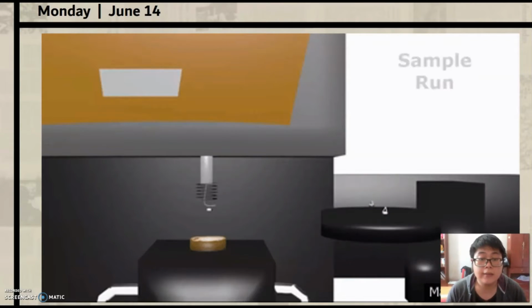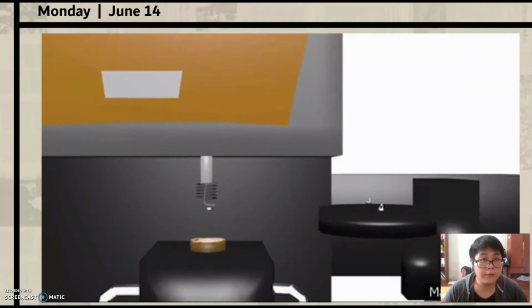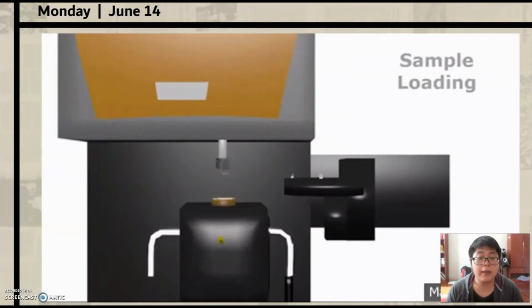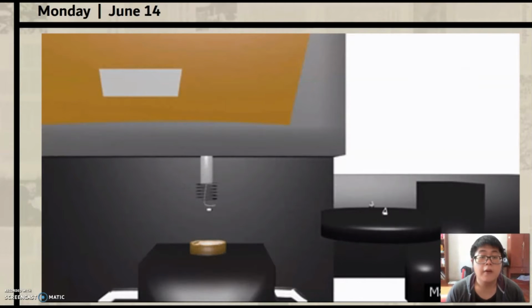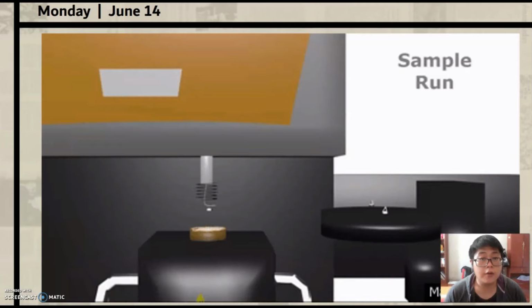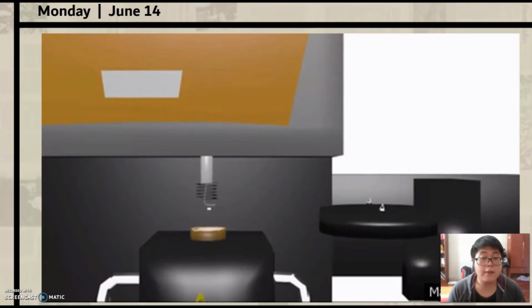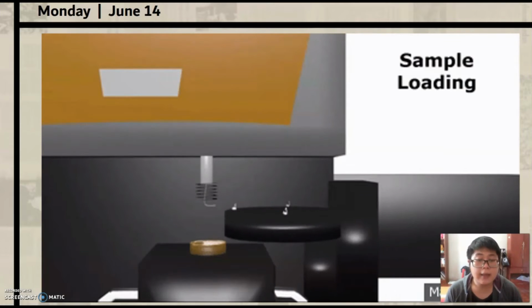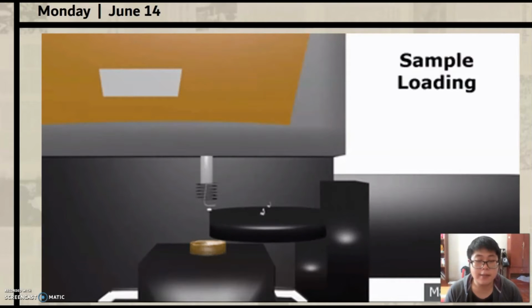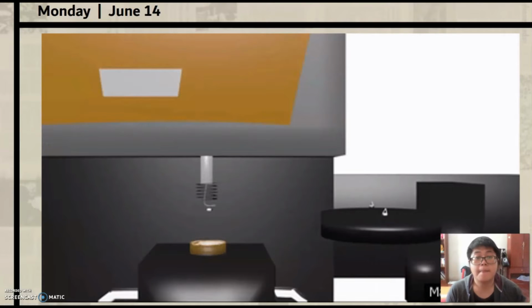data. The TGA is used to determine the mass change of a sample as a function of temperature and time at a given temperature. This technique is used for quality control and assurance. It is also used to analyze failure in mixtures and blends of complex polymers. And lastly, it is used to study chemical properties and chemical processes accompanied by mass changes.